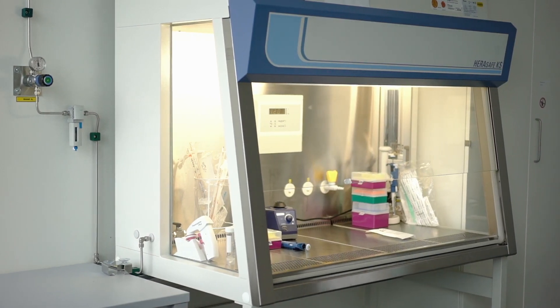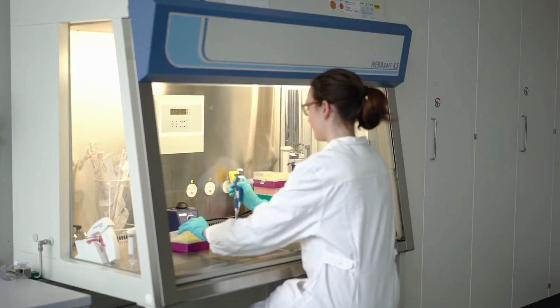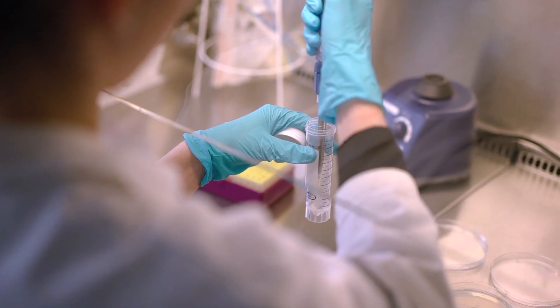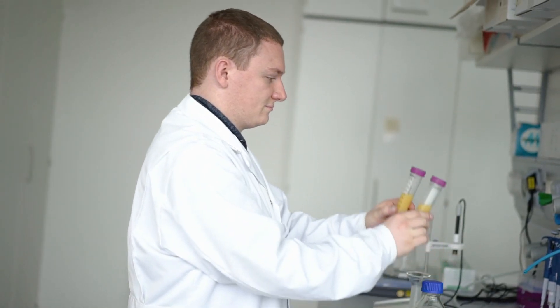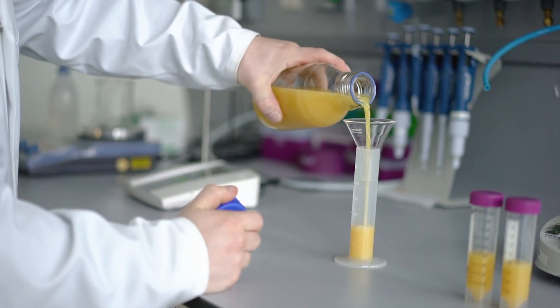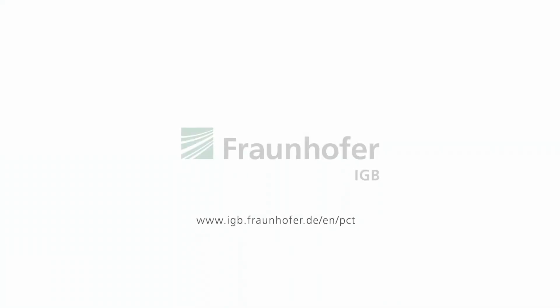We use established methods to verify microbial reduction and stability during storage, thus ensuring that spoilage is avoided. We also test the physicochemical and sensory quality of the products. This way we can support food and beverage manufacturers to develop new products and adopt this technology.